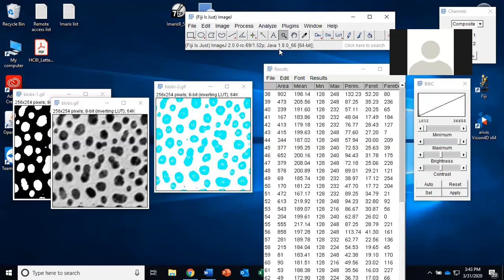But there's a lot of difficulties to that. Let's say one of your channels is expressed everywhere in the cell and the other channel is only expressed in a few small places. Depending on how you do that correlation, you can get totally different numbers.